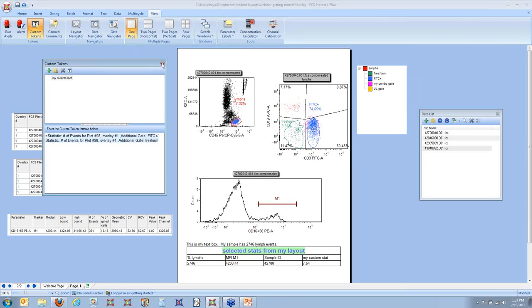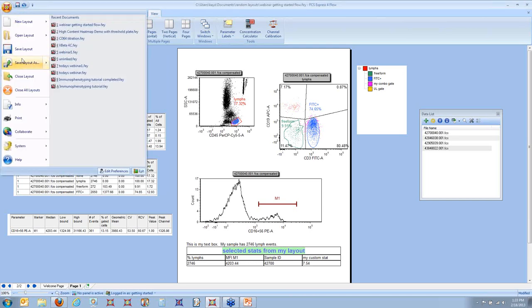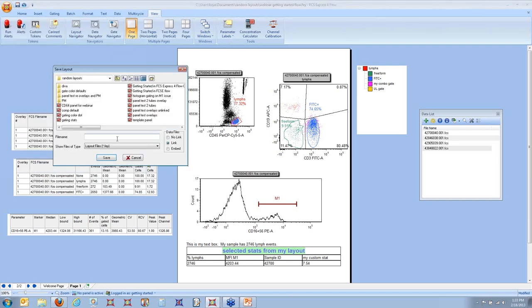Okay? Great. So are there any questions about tokens before I go on? Now's a really good time for me to save my layout. So I'm just going to save this to my desktop and call this our webinar.